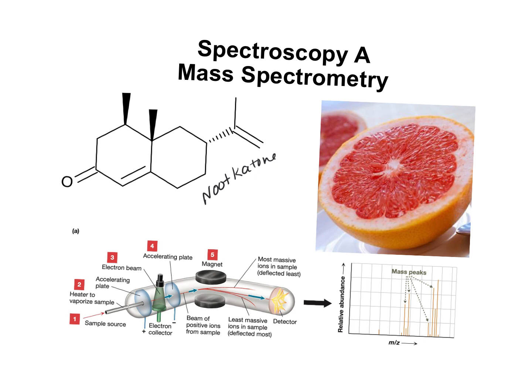Now, research from the CDC shows that it acts as a repellent for ticks, mosquitoes, and other insects, and works better than other natural insecticides like citronella. So one of the things that we do as chemists is we determine the structure of organic compounds when they are isolated from natural products, like the grapefruit here.